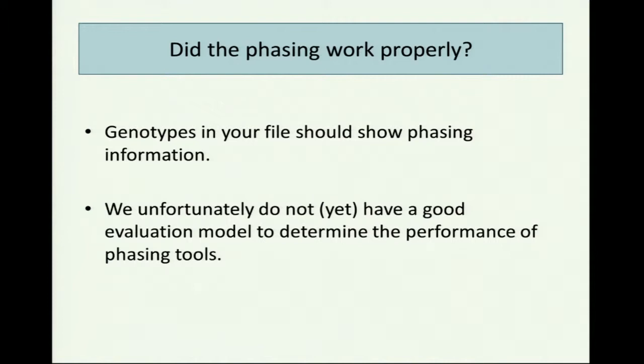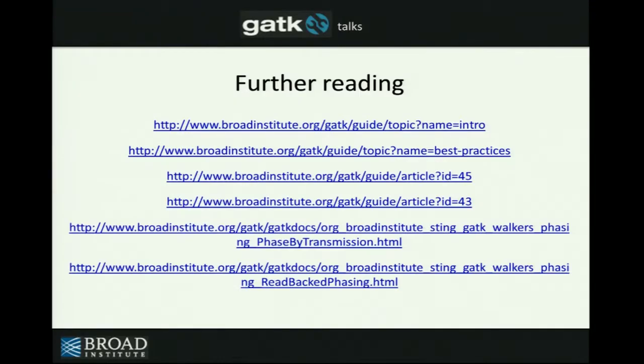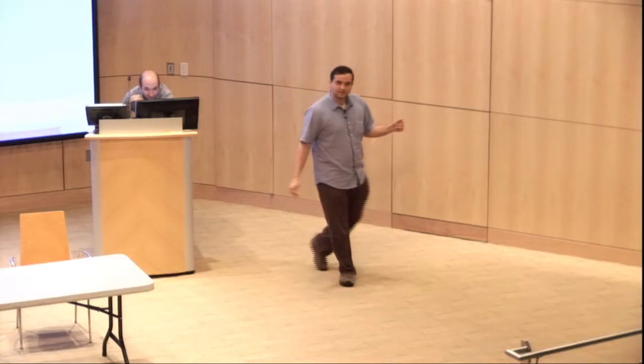In terms of genotype refinement, obviously genotype concordance, if you have truth data, really tells you whether that's working well or not. You can also do things like leave out samples when you do genotype refinement and ask whether there's high or low concordance. If there's high concordance, then that means a few things changed, which is reasonable. But if everything is changing, something has gone wrong. Yeah, and so that's sort of it for phasing and recalibrating your genotypes. Are there any questions on that particular section?